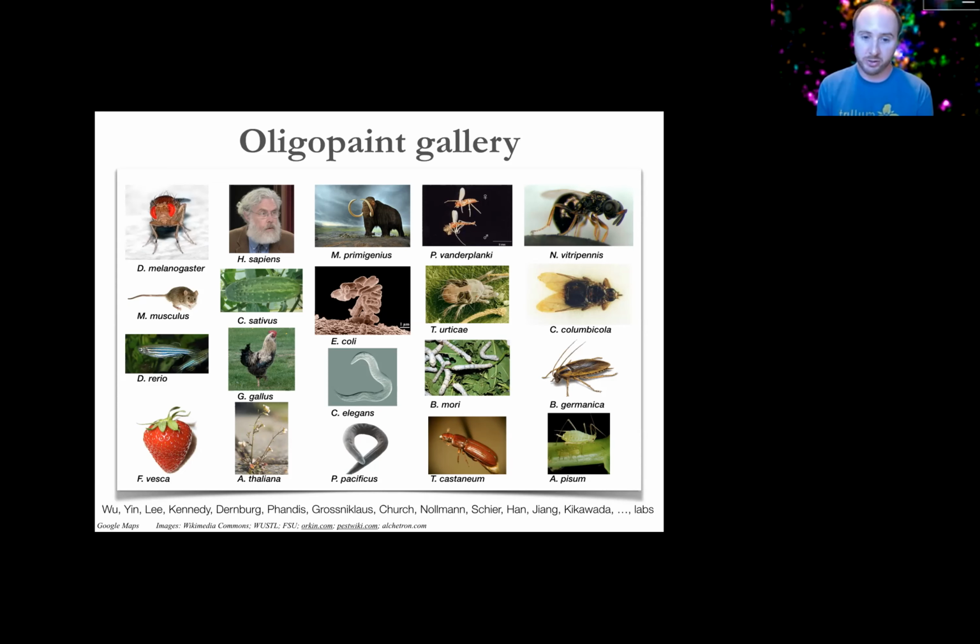If you have a sequenced genome that's reasonably good, you can go in and use the informatic tools we use to design the probes, and I'll talk about those a little bit later, and go ahead, including even in things like mammoths, they're doing it, which is kind of crazy. So this has also been really fun to see as a developer.